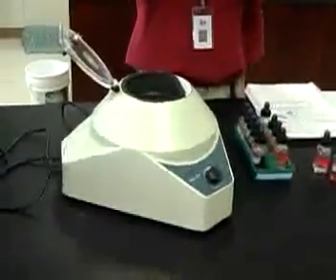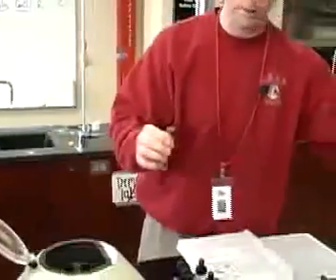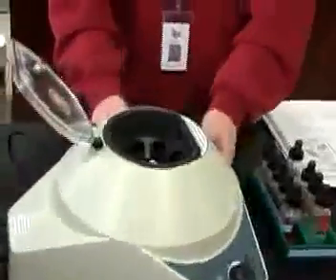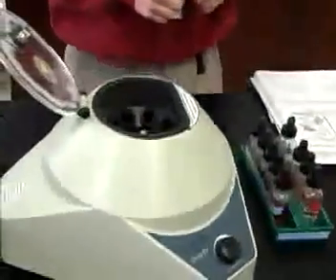And what it does is it takes the solid that might be dissolved in the solution and compacts it and brings it down to the bottom of the test tube. When you load a centrifuge, it's really important that the centrifuge is balanced. If the spinning part of the centrifuge is unbalanced, then it'll start to wobble and, in some cases, actually start to kind of walk across the table. And of course, that's not a very safe situation.